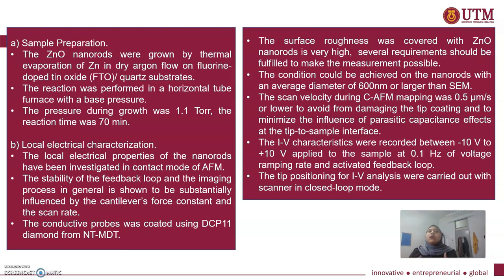The current voltage characteristics were recorded between negative 10 volts to positive 10 volts applied to the sample at 0.1 Hz of voltage ramping rate and activated feedback loop. The tip positioning for IV analysis was carried out with the scanner in closed loop mode.